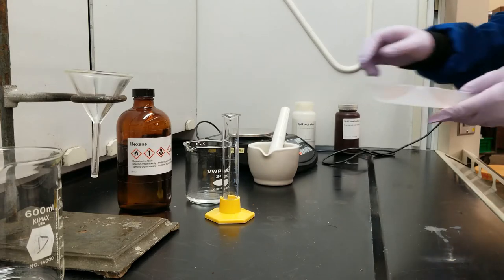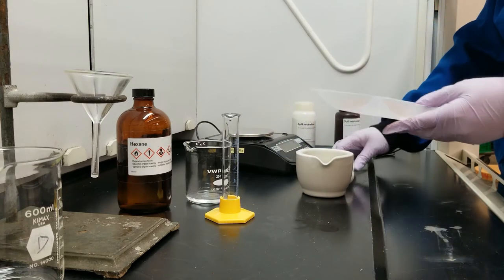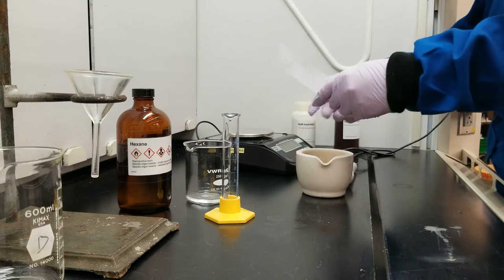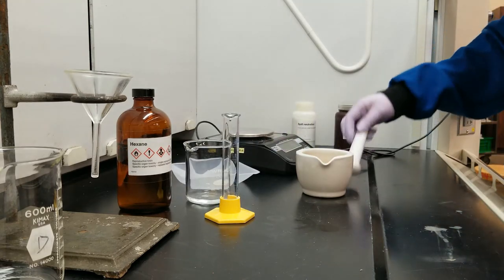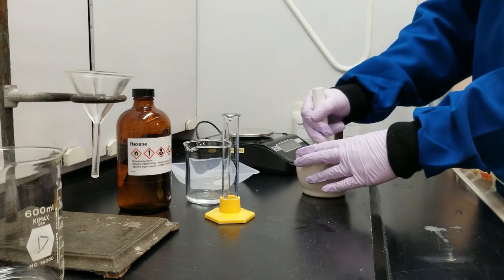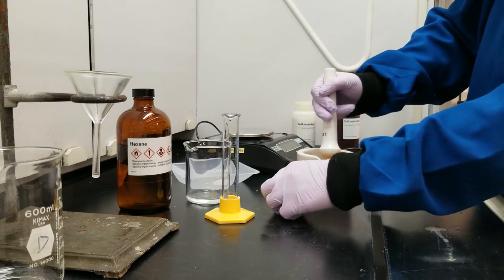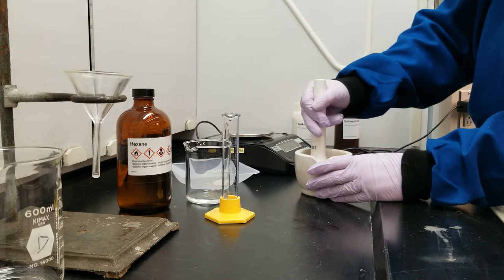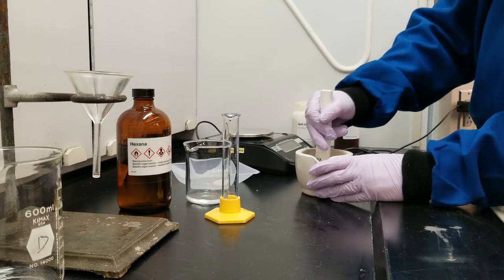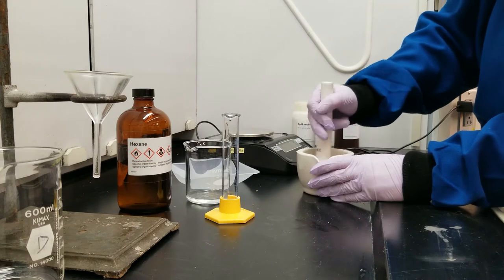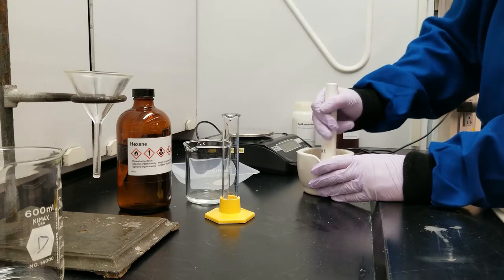Then I'm going to take my ten grams of potato chips, and I'm going to put them in my mortar and pestle. The mortar is the bowl bit, and I'm going to grind them up with my pestle, which is the stick bit. Trying to keep all my potato chips in here. This is so we can increase the surface area of the potato chips so they interact better with my solvent.